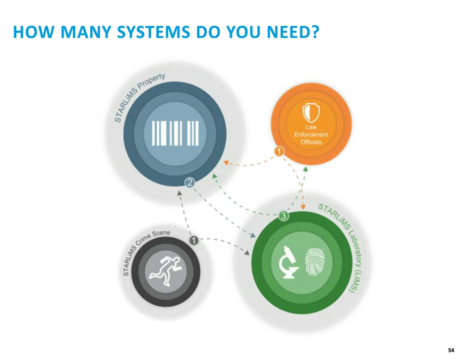Anytime one has to interface two separate systems, even if they're two separate modules from the same company, those interfaces have to be maintained. And if you're dealing with different vendors, you're talking about multiple service contracts, etc. So you want to consider, is there a vendor that I can go with that can provide for more of my needs without having to do these separate modular interfaces? And then the other system that we need to consider on top of all of this is our quality system. Very important. That's the overreaching umbrella over everything that we do in forensics.